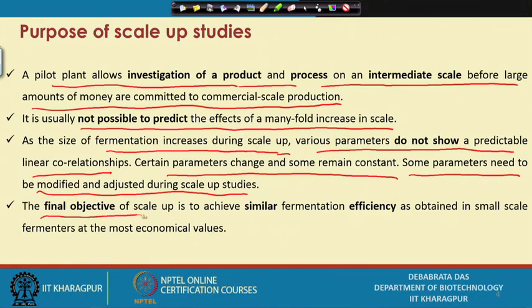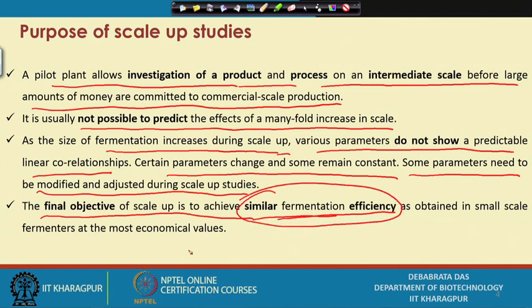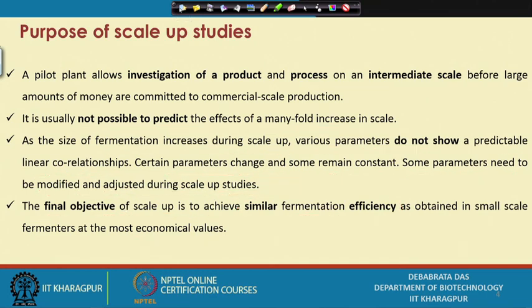And the final objective of the scale up is to achieve similar fermentation efficiency. This is very, very important, that whatever efficiency we get in the small scale, the same efficiency we should get in the bigger scale, at the most economical values. So these are the very important aspects of scale up.